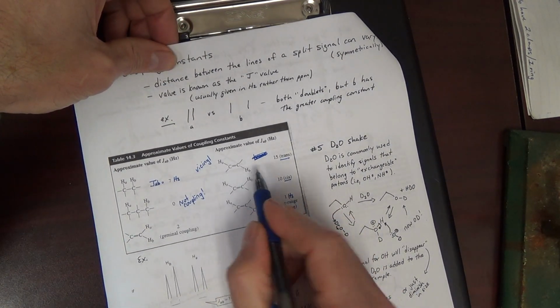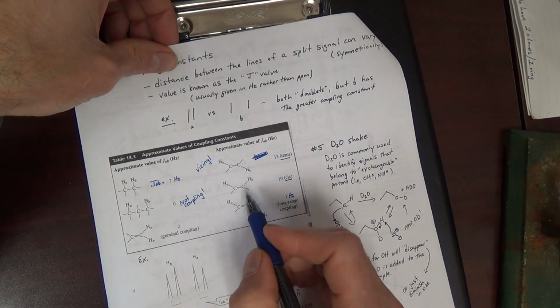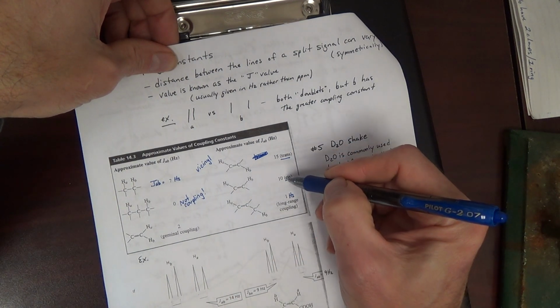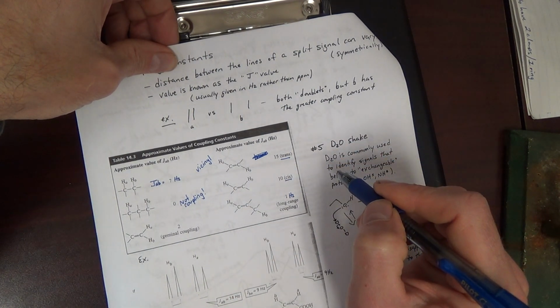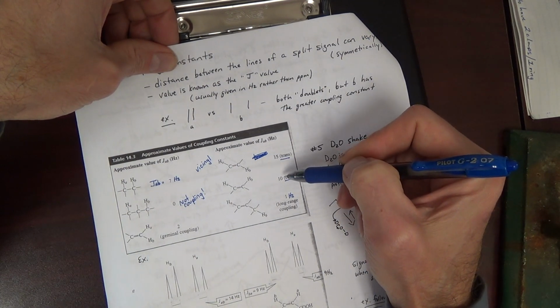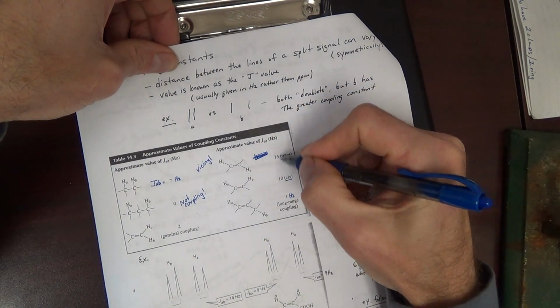Vicinal trans hydrogens are going to have a coupling of about 15 Hertz. And vicinal cis hydrogens, the coupling will be smaller at about 10 Hertz. Now we're not going to go into why the coupling is different at this level, but we'll just make this statement.